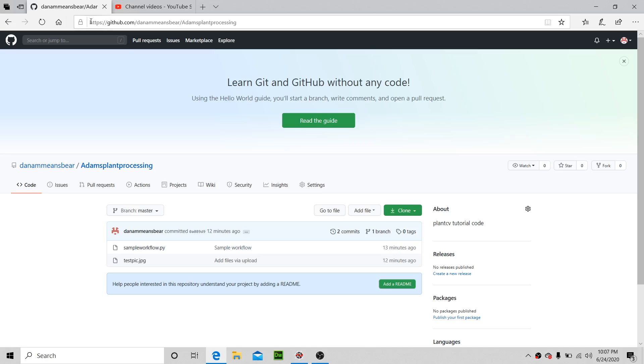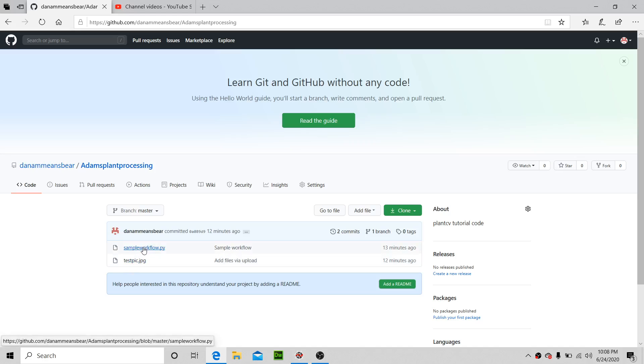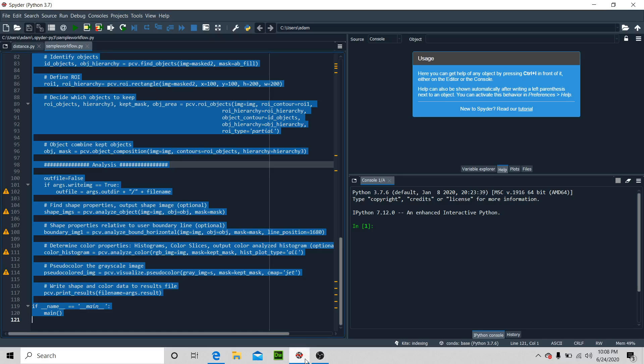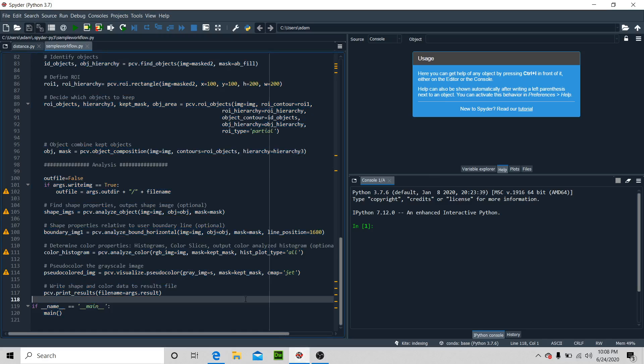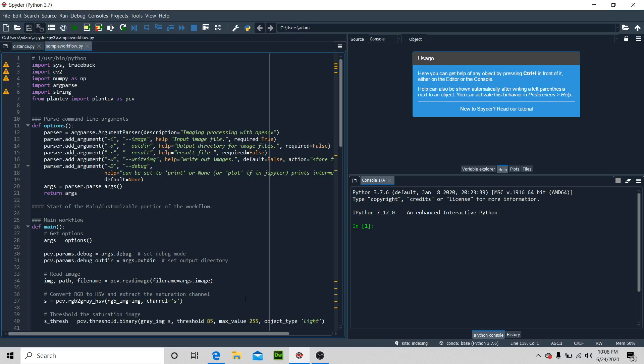The URL is https://github.com/danammeansbear/Adamsplantprocessing. You're gonna want to clone this whole repository, save it somewhere, and then open this sampleworkflow.py in Spyder.